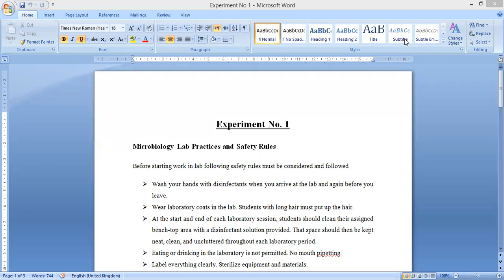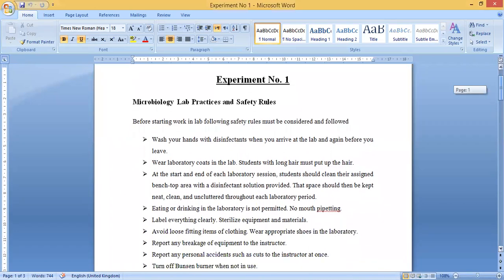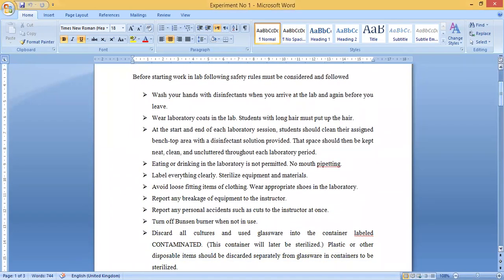Whenever we talk about working in any lab, we must first consider the safety measures. I have mentioned some of the basic lab practices and safety rules for working in the microbiology lab. Before starting work in the lab, the following safety rules must be considered and followed at any cost.